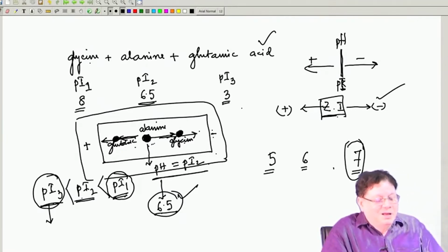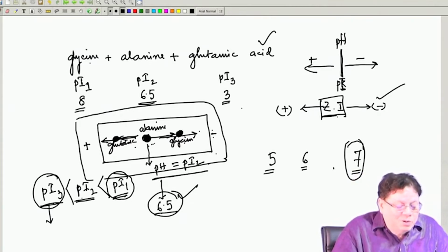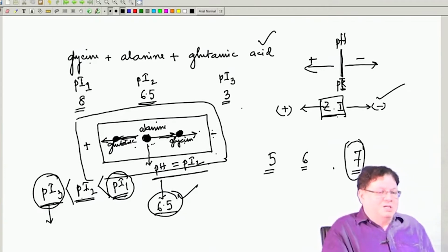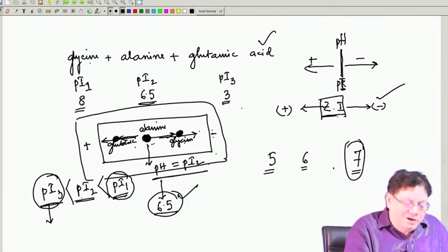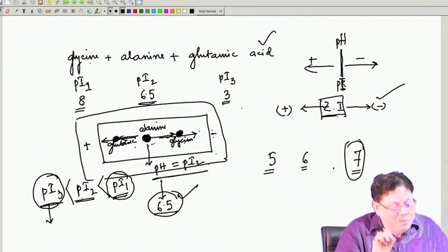Now, amino acids unfortunately do not have fluorescence, that if you shine light it will fluoresce. So, you cannot do that, but there are other chemical tests which can give color for the amino acid, and that will show the location of the amino acid at a certain place.